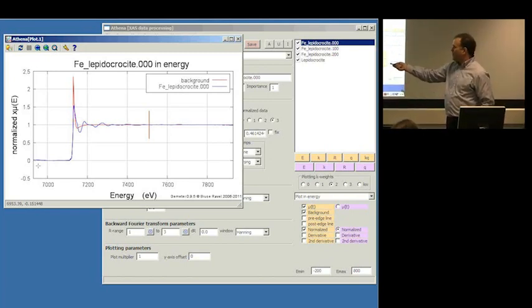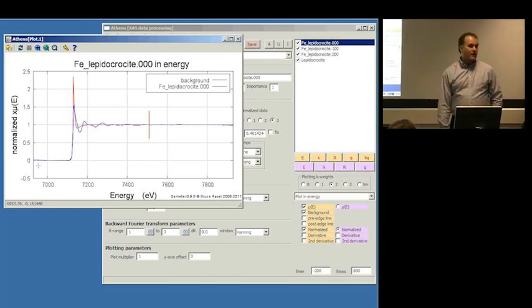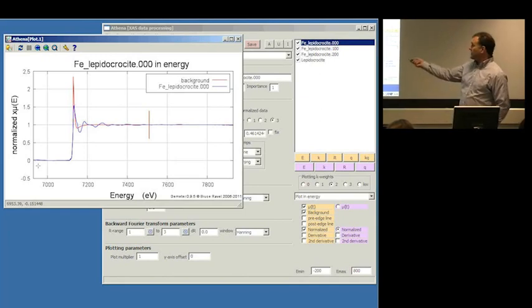And then in these data, there's a white line, so things work out such that the normalized data has this going up to some value. And what that value is depends upon the material. You'll find if you go measure a rare earth oxide at the L edge, that this thing could go up to 3 or 4 or 5 or something really big. The white lines in those situations can be really quite large. It's just whatever the data does.